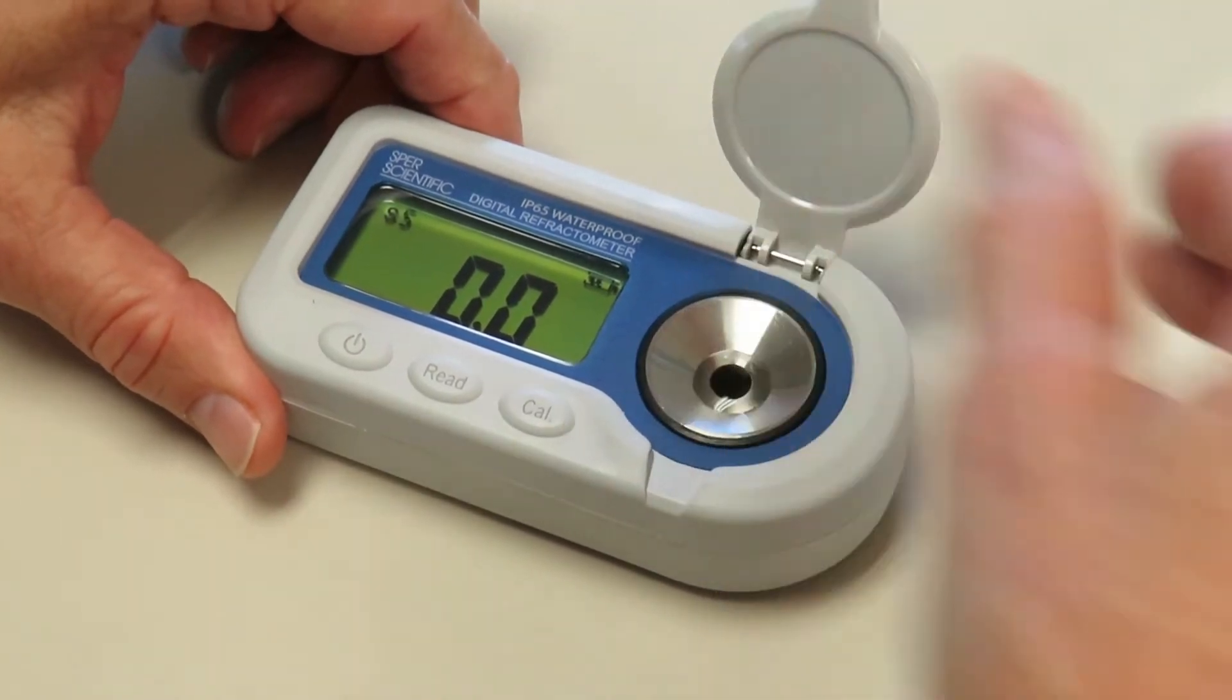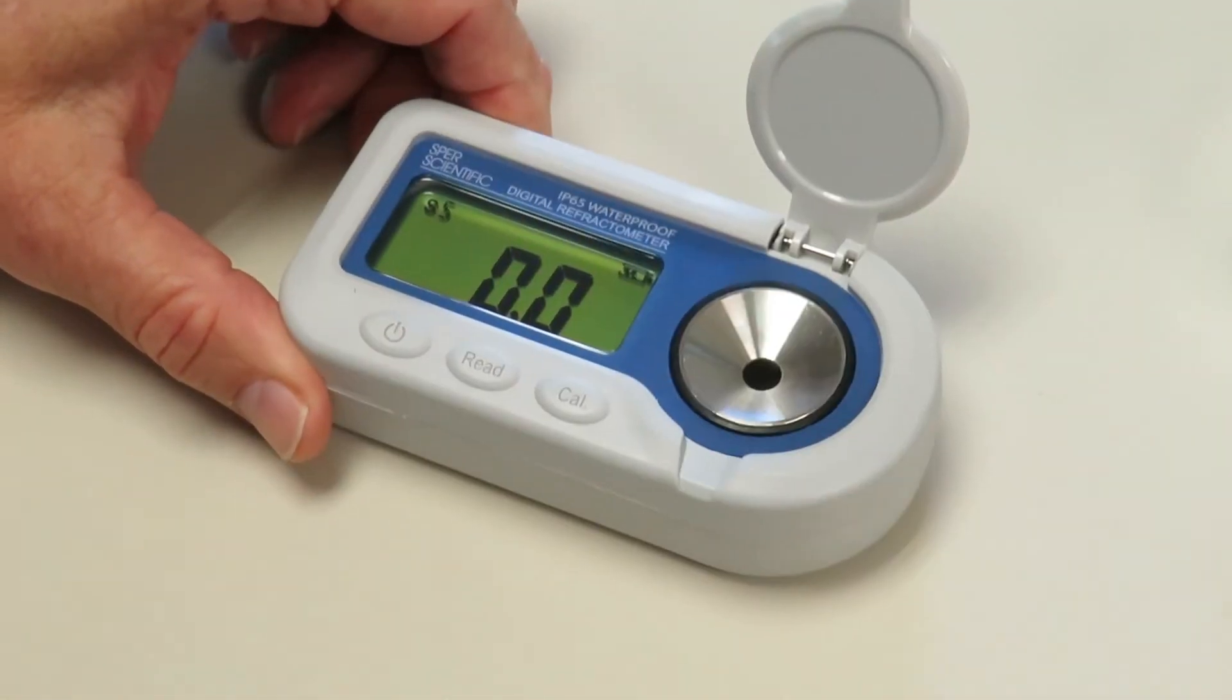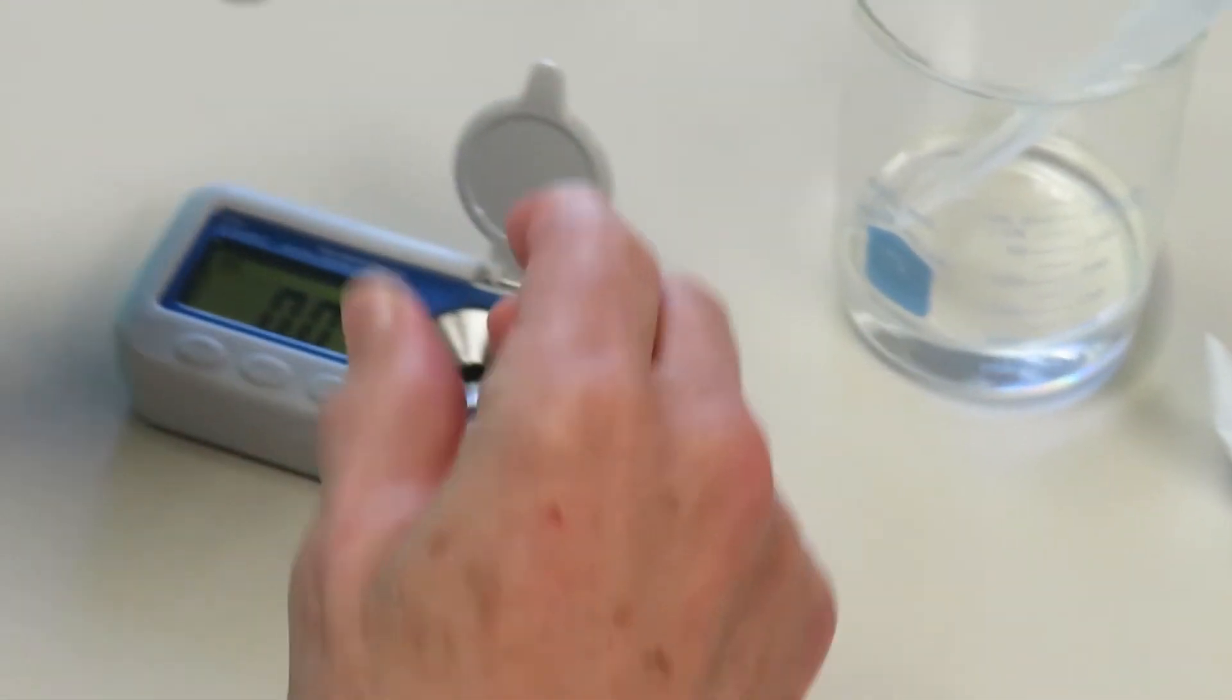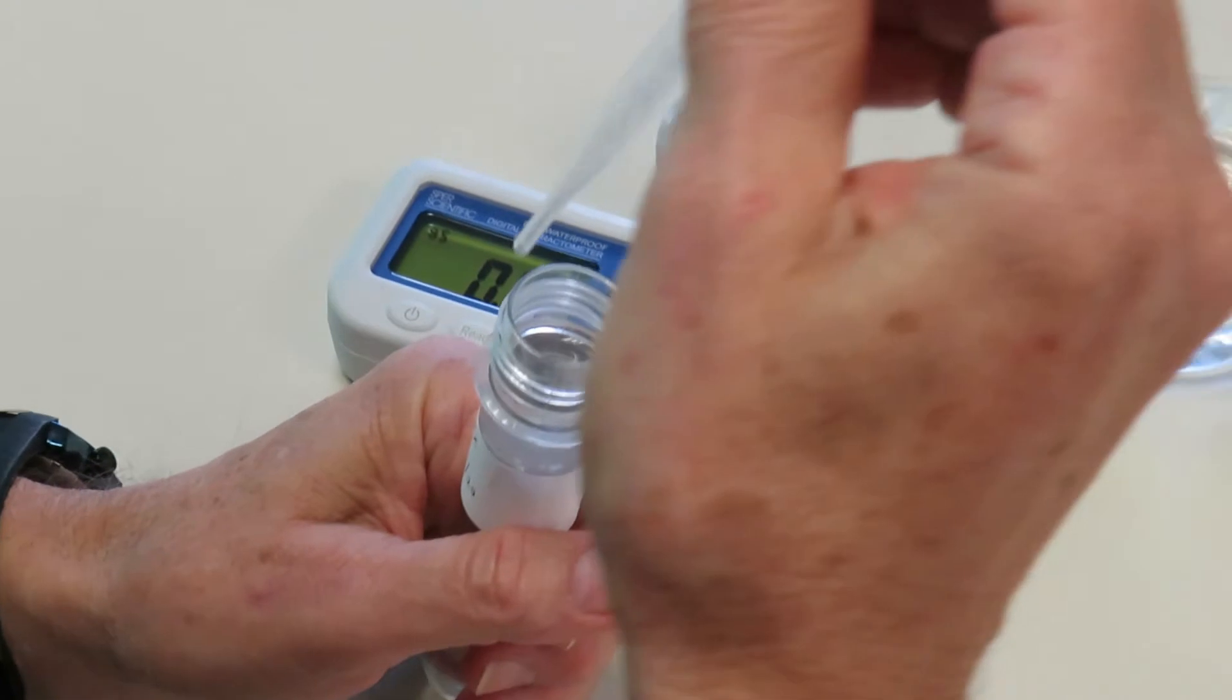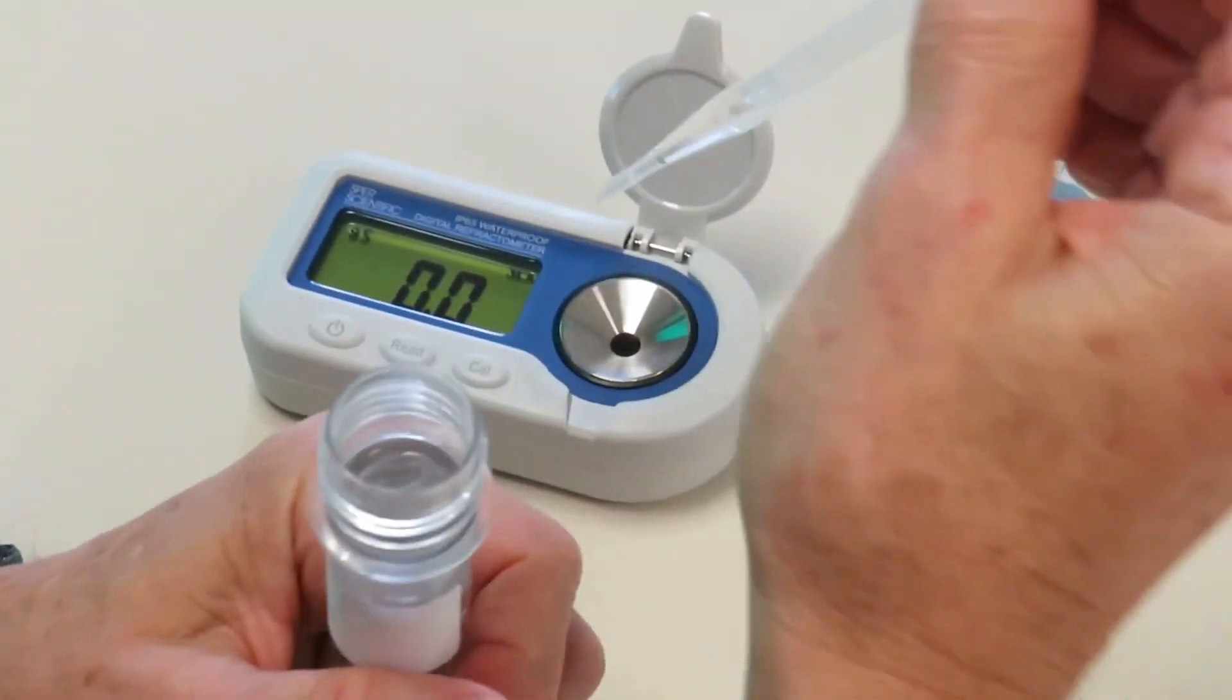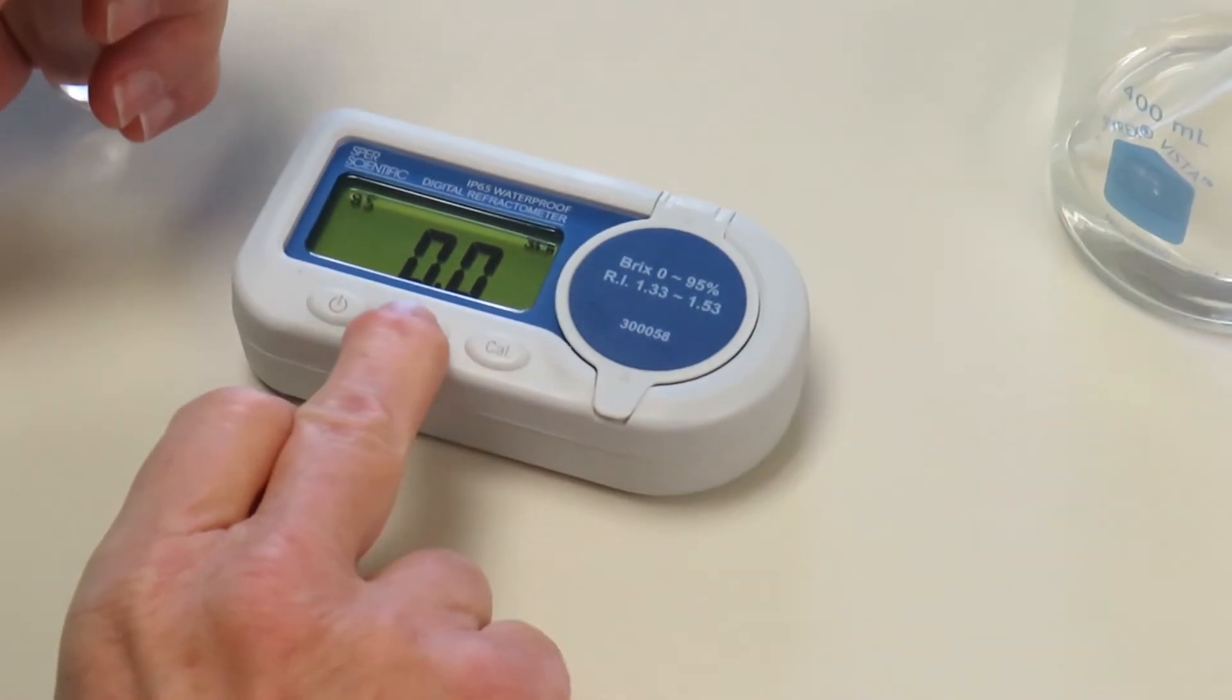Next, we'll show you how to read, so that's how you would calibrate it. And now I have here a sugar solution, and all we need to do to read it is put a few drops again, enough to cover that lens, cover it, and hit the Read button.